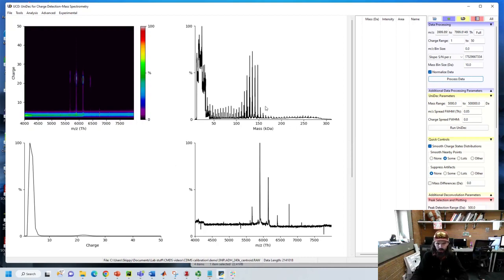Clearly we would need to do some work to clean this up. That's a topic for another video. But anyway, that is how we do the calibration.